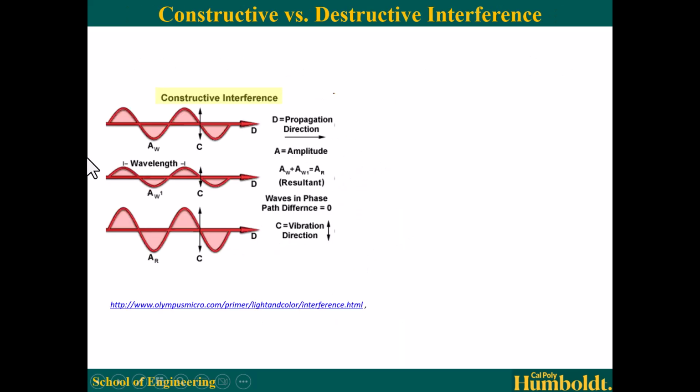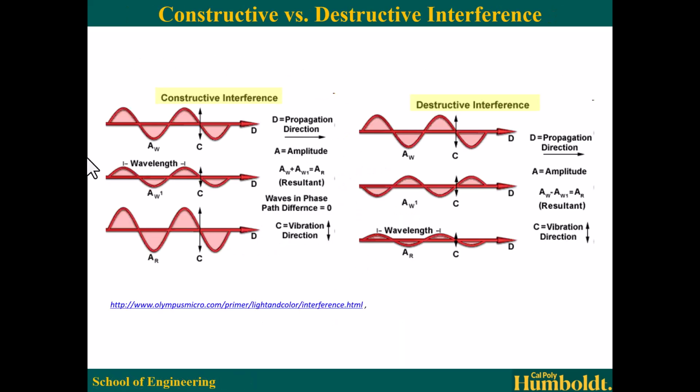So again, for X-ray diffraction, when we see these signals that appear in our XRD, we are going to only see signals when we have effectively perfect constructive interference. So when we have incoming and scattered waves, when they interact and they're in phase, so waves with phase difference 0, then we see that change in amplitude here. If there's destructive interference, if there is a difference in the phase, then we're not going to see a signal.